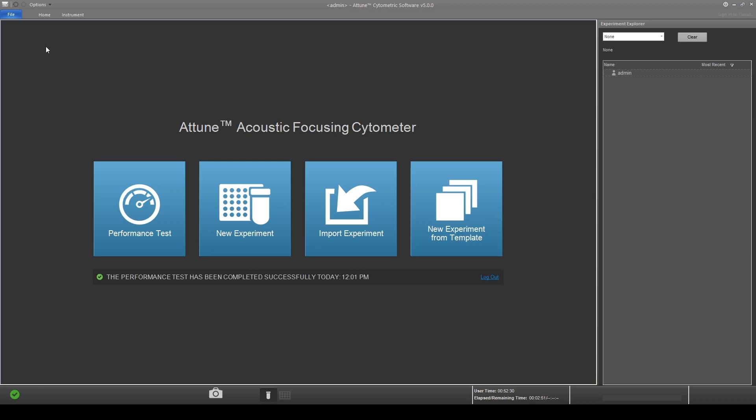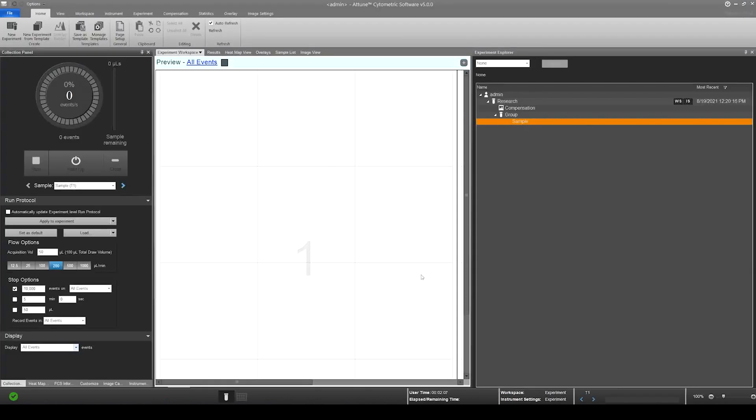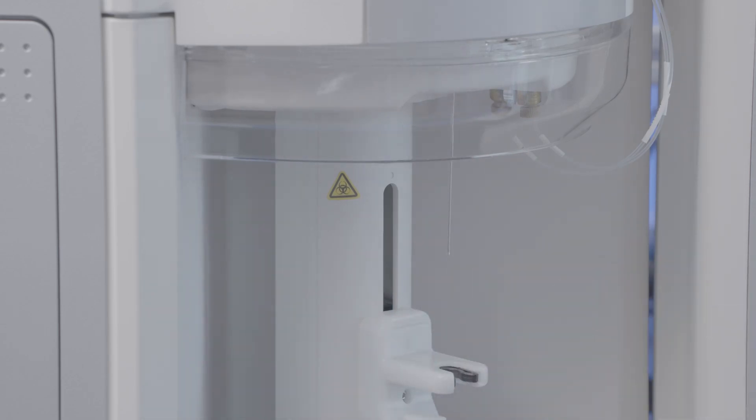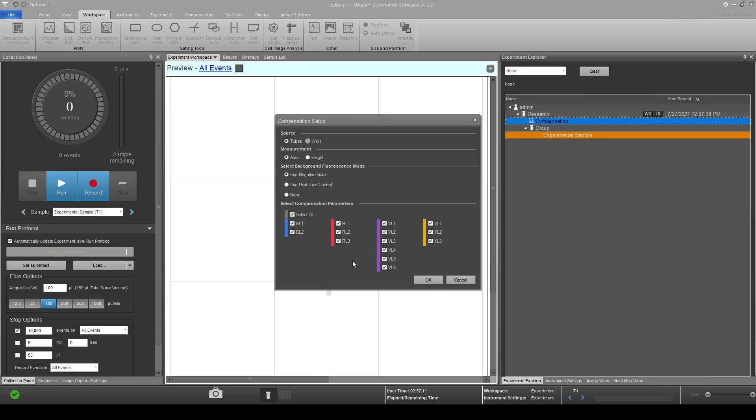To perform compensation setup, click on the new experiment icon. Enter the name of your experiment. Lower the sample tube to initiate a system rinse. Select and expand the compensation option from the experiment explorer panel.